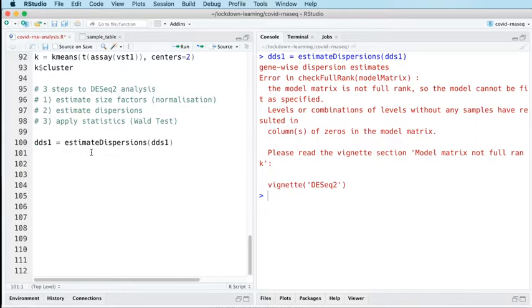So what we're going to do, okay, I know what to do. We're going to, right, so, sorry, I'm talking to myself. Okay.